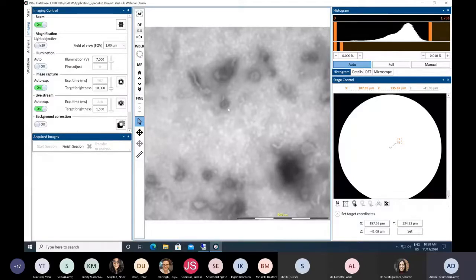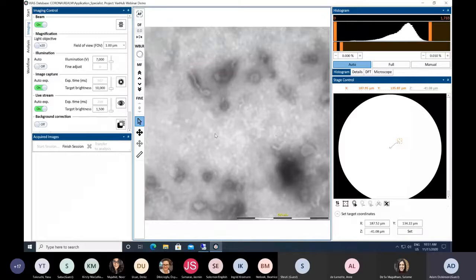So this is where the autofocus has actually finished its process. Now, to our actual eyes, this might not look like it's in focus. It's actually in focus for the microscope, but it's probably not in focus for our eyes and our image analysis algorithms. So typically what I would do here, and this is very similar to what I would typically do for any live cell imaging or bright field imaging, we defocus the sample ever so slightly just to enhance the contrast and the edges of some of these objects that appear to be in the image.